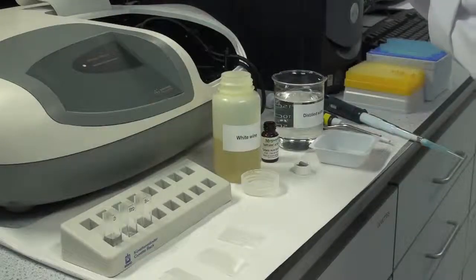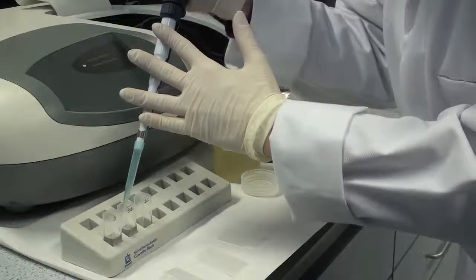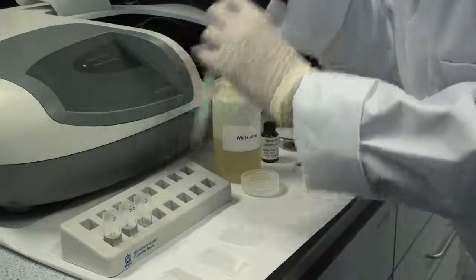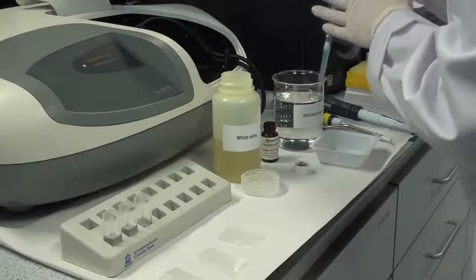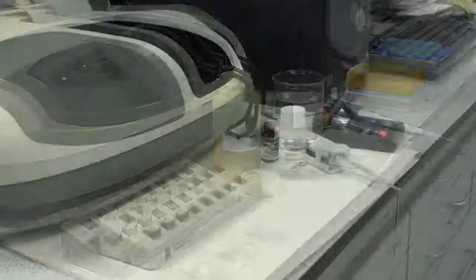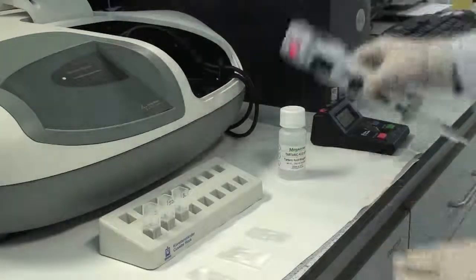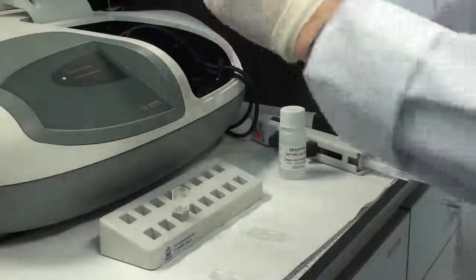Add 1.85 millilitres of distilled water into the blank cuvette. After the addition of distilled water, add 0.4 millilitres of Tartaric Acid Reagent 1 to each sample, standard, and blank. Mix each solution, then exactly one minute after the addition of Reagent 1, read the absorbance A1 of each solution.